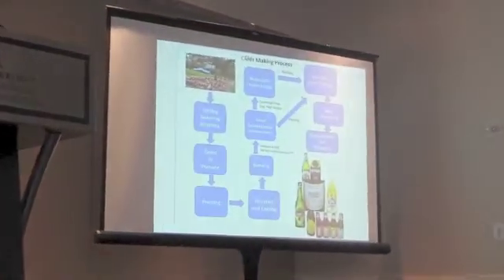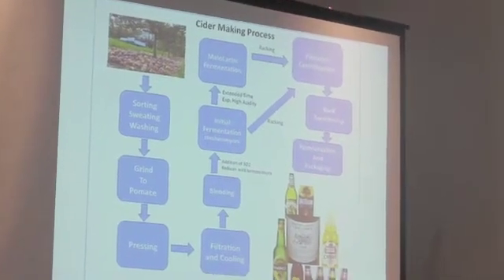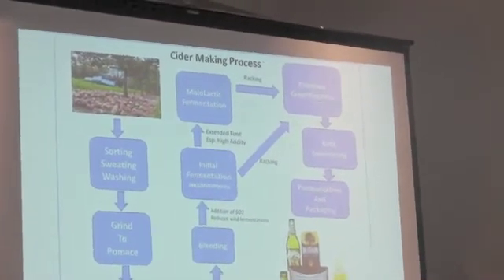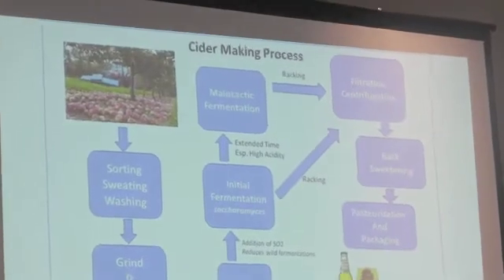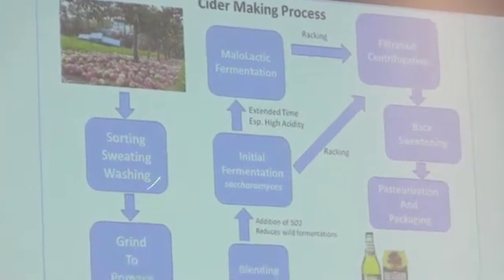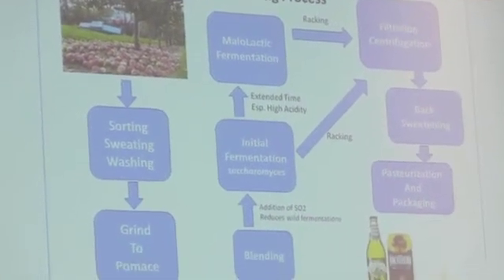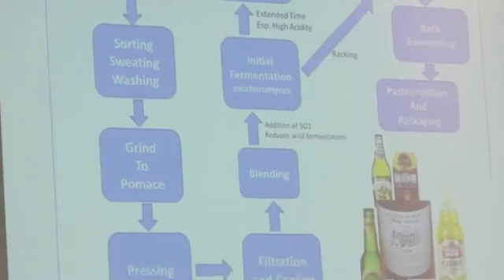And I think it's like $800 for a nutrition label per sample, and all it tells you is nitrogen and really simplistic things. It doesn't tell you very much. So where can you use NMR in the process? You can use it anywhere. As long as you can get a sample, you're going to look at whatever is in the water solution. So you can look at the apple juice that you're pressing. You can look at it at any stage in the fermentation process.